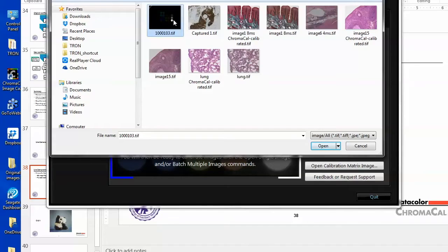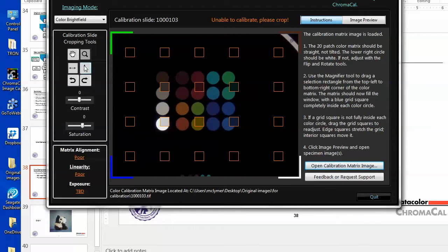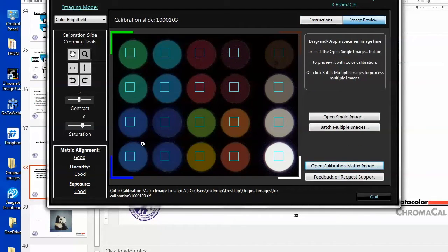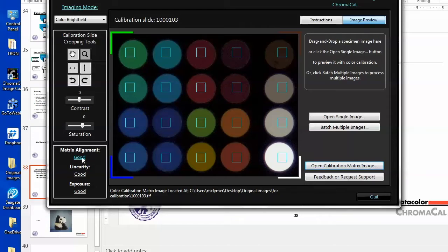So that makes it also a standard. And these are interference type filters, so they're not subject to the typical fading that you would find with plastic film that people have played with. So I'm going to open that up, and depending on the magnification you used, it'll fit or not fit in the window. First step is to put the grid in the boxes, which is kind of difficult, so instead I'm going to zoom. We've got all these flip tools, to go back and forth, but the white patch goes here where the white corner is. It's easy to remember. I'm just going to click and zoom across like this. Boom, done. So those boxes went from orange to blue. Tells me I'm aligned. You see here, it tells me my matrix alignment is good.